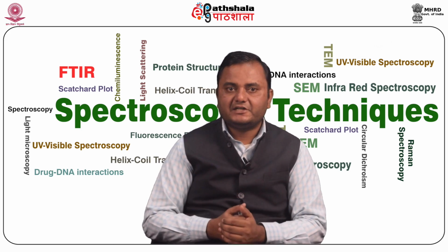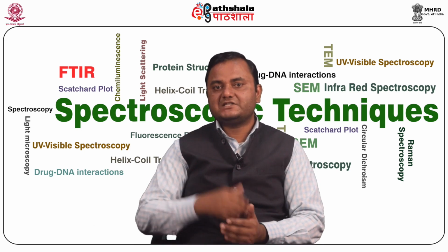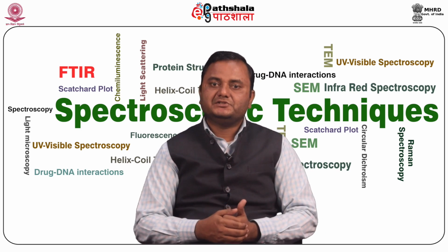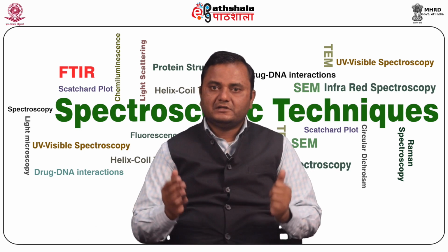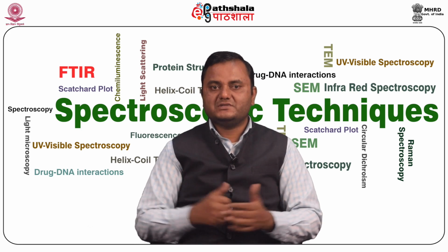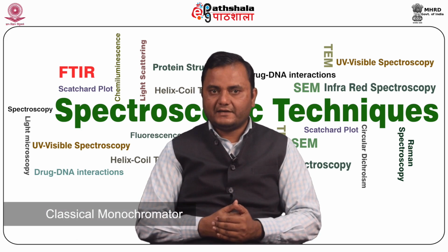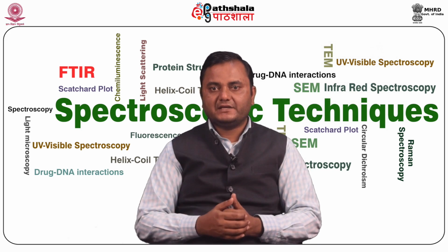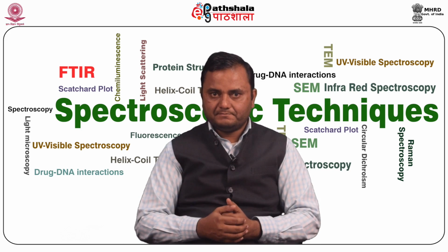The third advantage of FTIR is much higher energy output, known as the Jacquinot or throughput advantage, because it does not use a classical monochromator. It requires no slit device, making good use of the available beam.